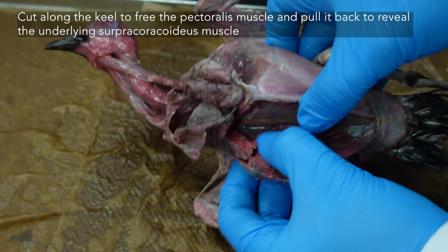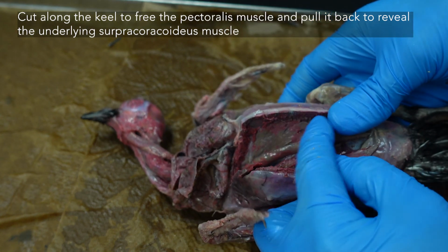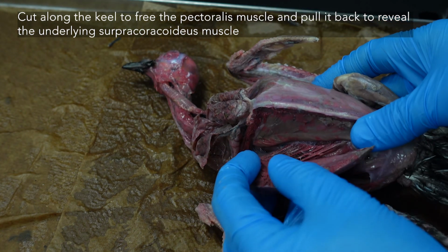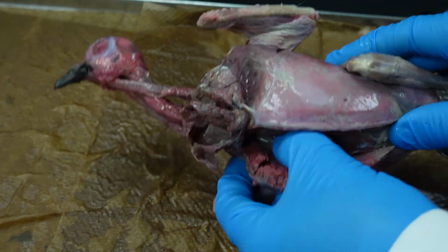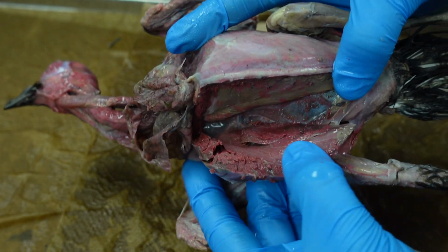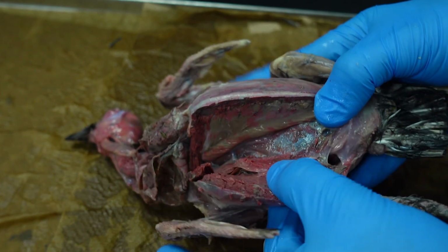Peeling those muscles apart, you can see the fibers of your pectoralis muscle. And then your separate supracoracoideus. Both fibers are aiming up towards the shoulder over there. If you're seeing those fibers still kind of connecting down here, you can run your thumb down to lightly separate your pectoralis muscle. So you're separating your large pectoralis muscle from the smaller underlying supracoracoideus muscle.